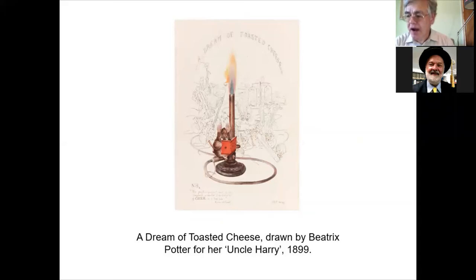Now, during the second half of the 19th century, much effort was put into forced ventilation of laboratories. Professors became aware of the reluctance of students and researchers to use fume cupboards, if indeed they even had enough fume cupboards, because most laboratories didn't, and certainly most chemists didn't want to bother with fume cupboards. But the draft of this forced ventilation conflicted with the draft in the fume cupboard, largely leading to the abandonment of the idea. The use of electrical fans both in the laboratory and in the fume cupboard solved the problem in the early 20th century.